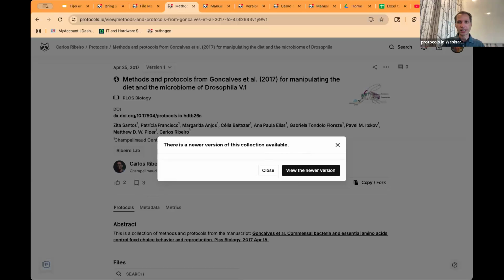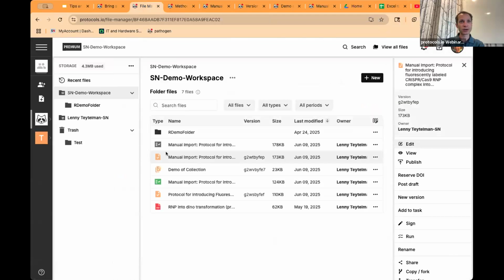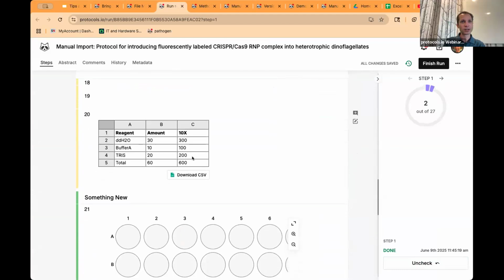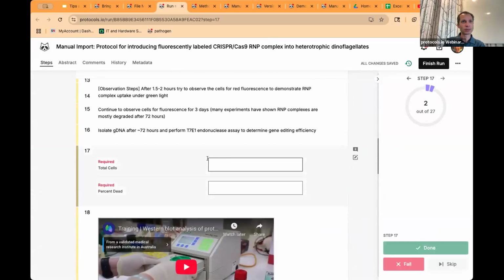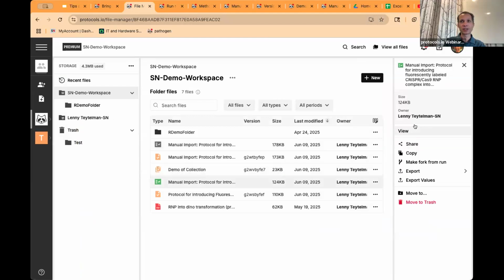All right. And then the last question that I see is, can a researcher download the smart component as a CSV file from each run record? I don't actually know the answer to that. So let's take a look at our run record where I have filled out the component. So we can download a table. And where's the component that I ran through? Oh, this is one of the runs that's not finished. I didn't go through it. There's our finished run. Sorry, let's take a look here.